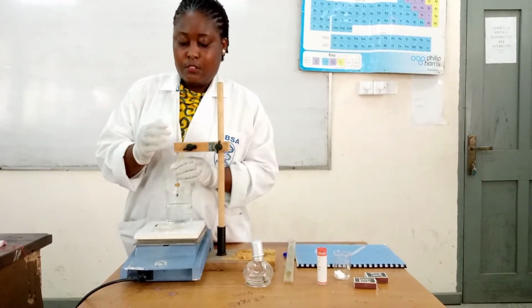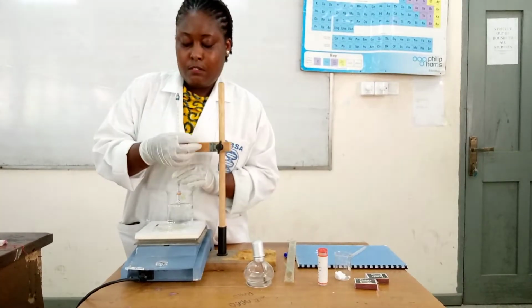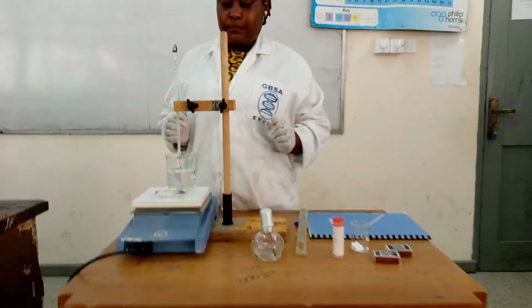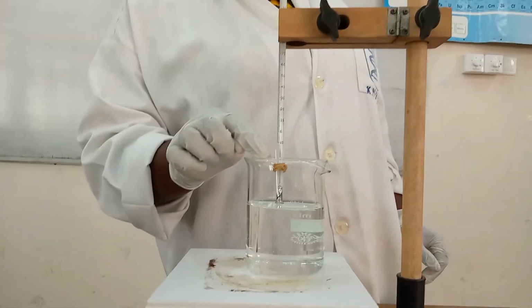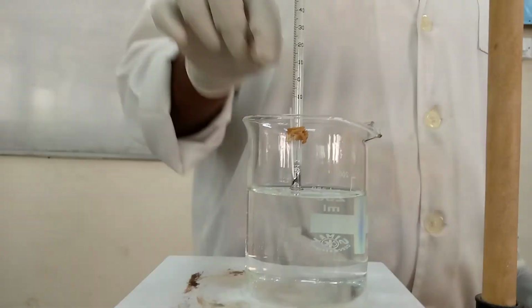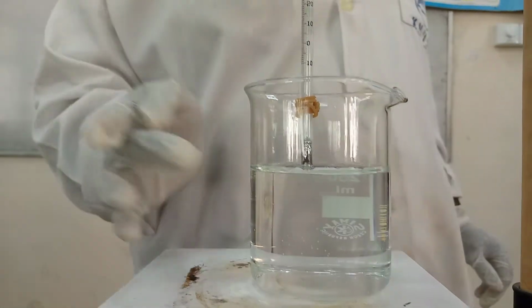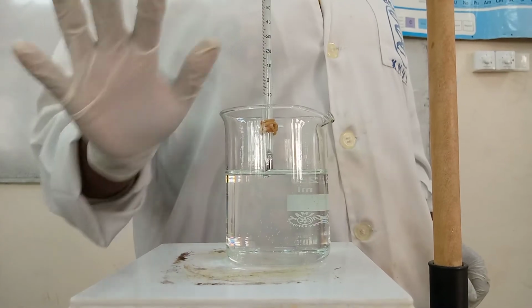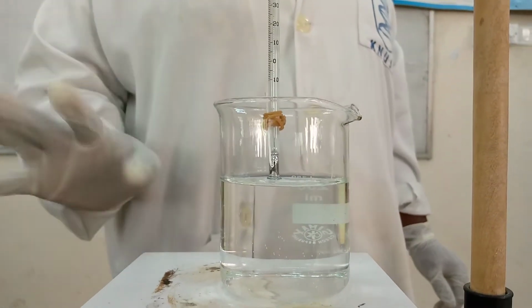Okay, so now I can drop it inside the oil and tighten it. Alright, and tighten it. So this is how we do it. You can see that the rubber band is not touching the paraffin oil. As I said earlier, the paraffin oil is hot, so when it touches, it can melt the band, and when it melts, the sample will drop into the oil, and we don't want that. It means I have to start the process all over again. I don't want that to happen.